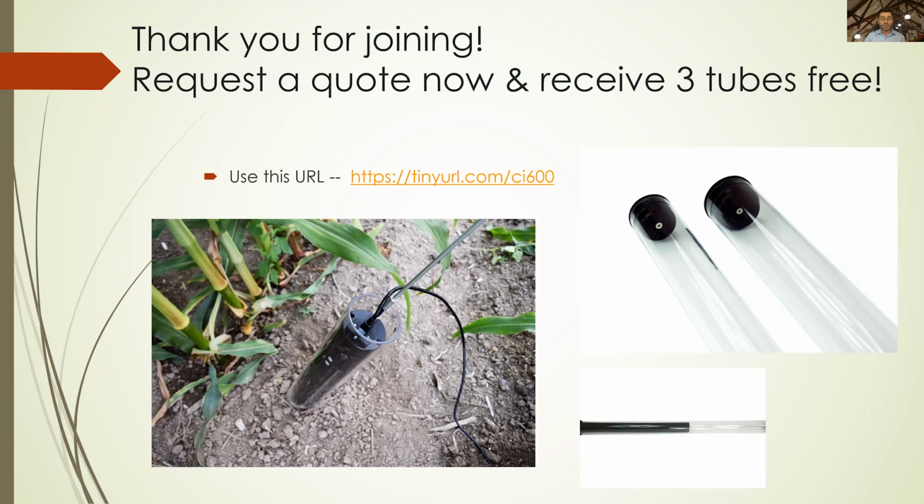The next question is estimating nodule size and number. You can kind of do that with RootSnap, that is correct. And just by adjusting, say, which color those lines are and the diameters, you can get a good size, diameter, and overall mass of your different nodules.